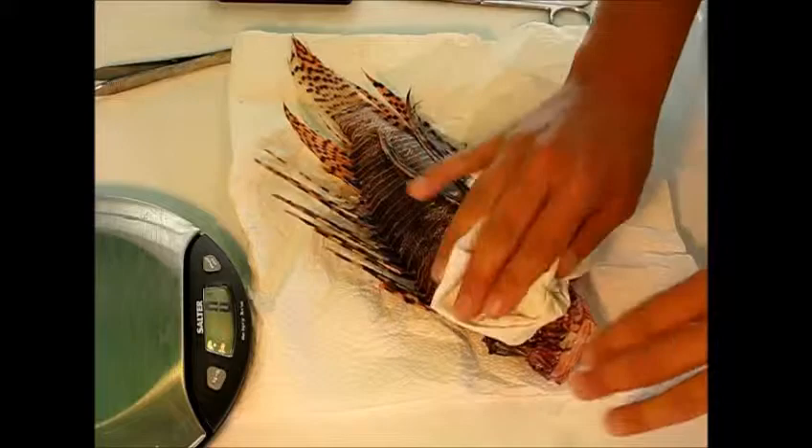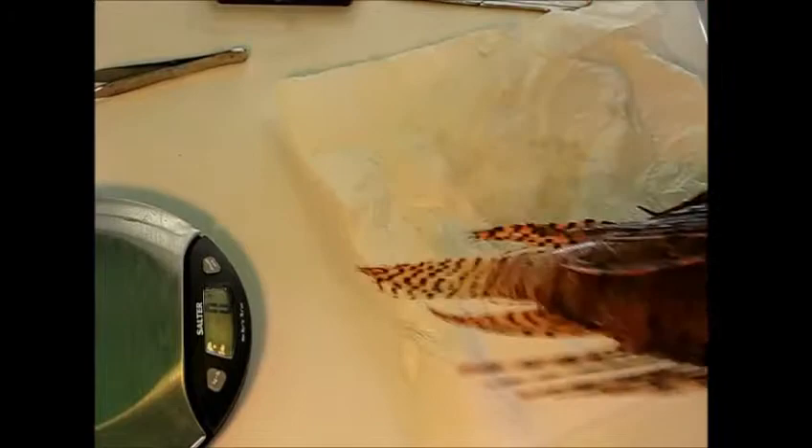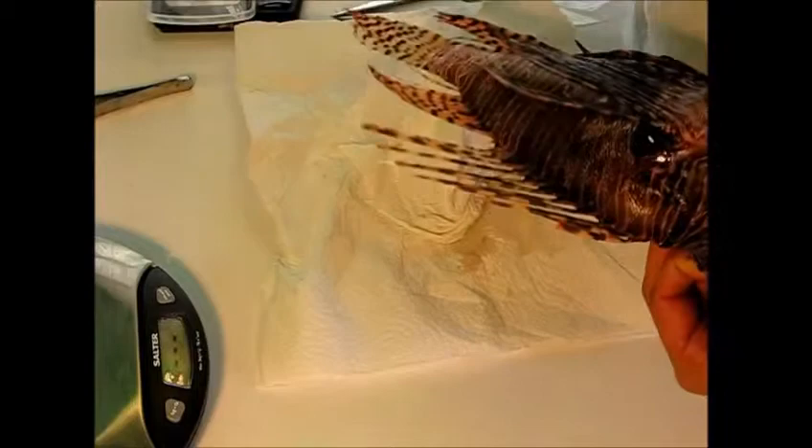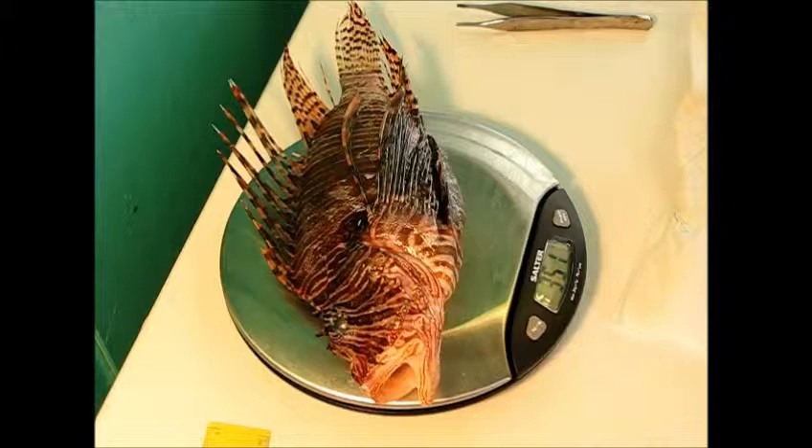The next thing we're going to do is weigh the fish. First we want to blot it dry to get off any excess water, then make sure that your scale is tared. Place the fish on the scale, making sure that no part of the body is touching the table. We record this in grams — it's 351 grams.